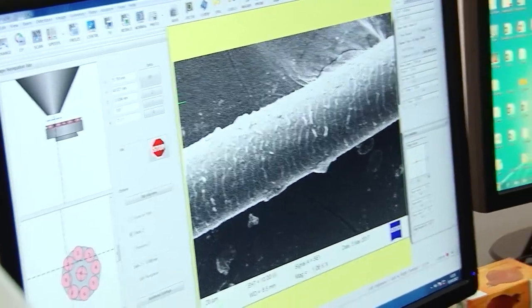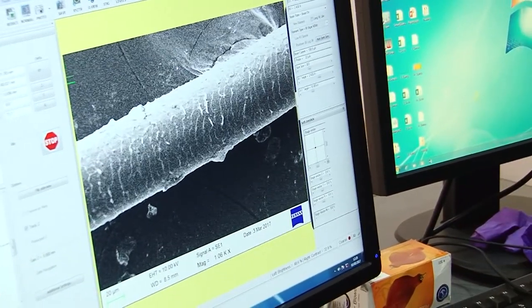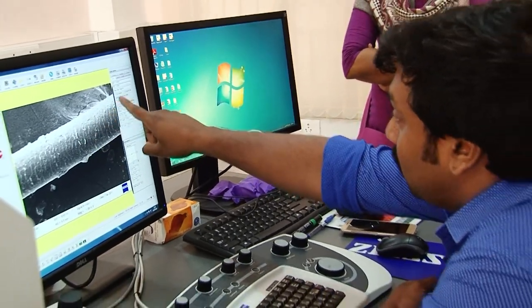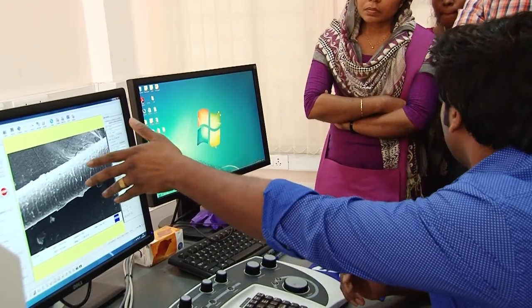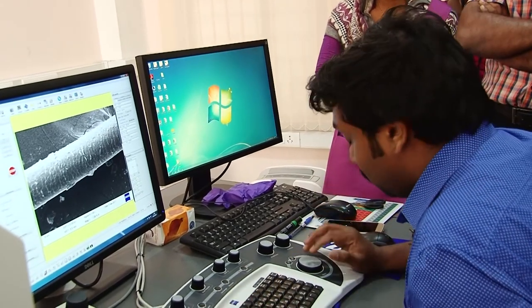If you can see these bright areas, they have arisen because the coating is not sufficient. If the coating is not sufficient, it will appear like this. See, that is known as a charging effect. I purposely did this because you want to see the mistake, how it happens. Then we will again focus this.